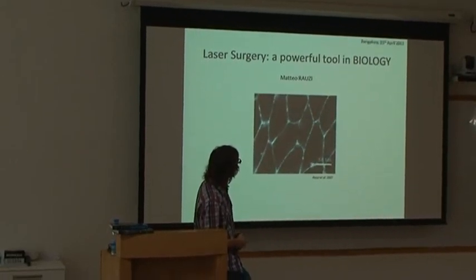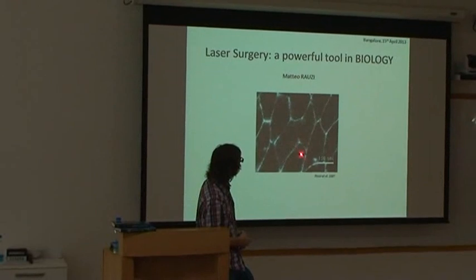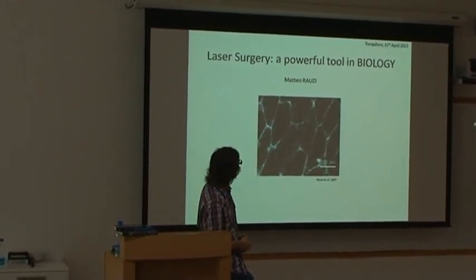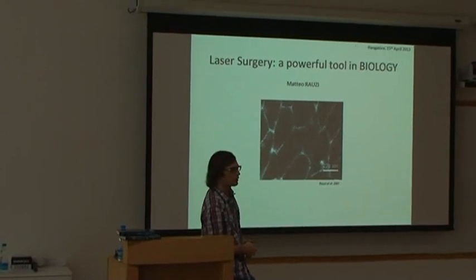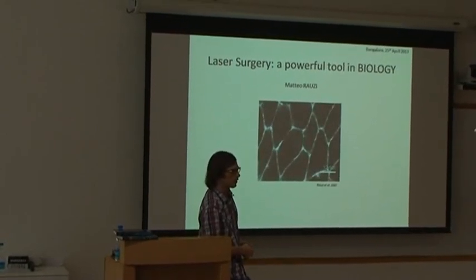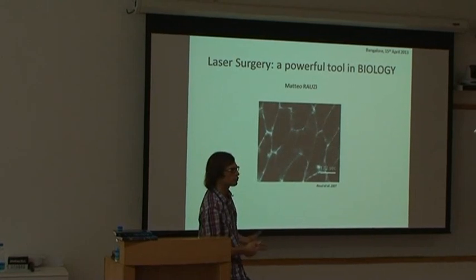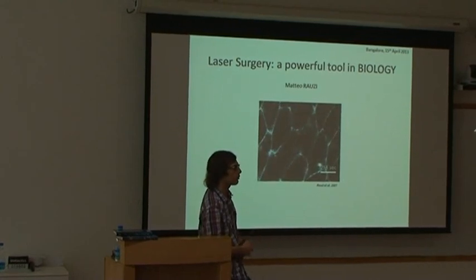So what you're seeing here, in fact, are cells, and you can see the outline. And this is the apical cross-section of these cells, of a tissue which is much bigger. In fact, this tissue is the ectoderm of the early developing Drosophila embryo. And what is marked here is epithelial cadherin, okay? Which are proteins responsible for the adhesion among cells.